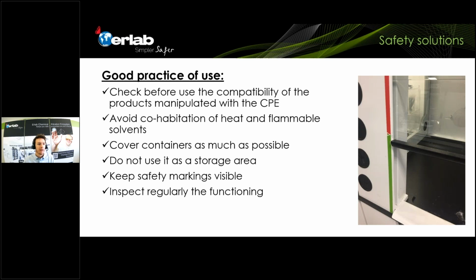That's important. Of course, avoid cohabitation of flammable solvents and acids or bases. It's important not to combine some chemicals in the fume hood when it's not necessary. Cover containers as much as possible, because then you have less evaporation. It's also important to cover containers just to evaporate less product, so you don't have to buy chemical products over and over again.